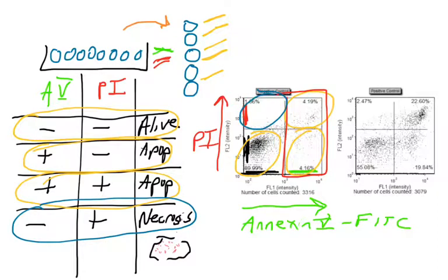The cells in this quadrant, 1.6%, those are necrotic cells, so they must have been damaged during the manipulation process by getting them out of the dish, shooting lasers at them. These cells have propidium iodine inside them, but don't really have Annexin-5 binding to them, so we call them necrotic. That's typically a very small percentage. If you're treating cells with a drug, and the positive control here is treating cells with something that induces apoptosis, you can now see that out of 3,000 cells, only 55% of them are Annexin-5 negative, propidium iodine negative. So those numbers have gone down from 89% to 55%, whereas if you look at the quadrants that are indicating the apoptotic cells, those have gone up significantly. We went from an 8% total apoptosis to over 40% apoptotic cells.